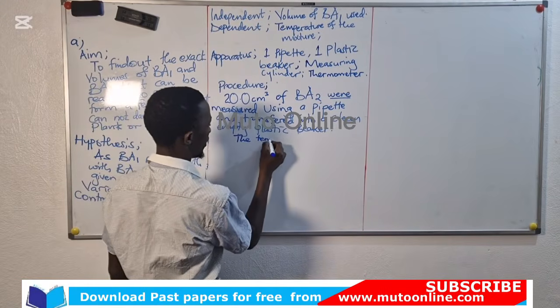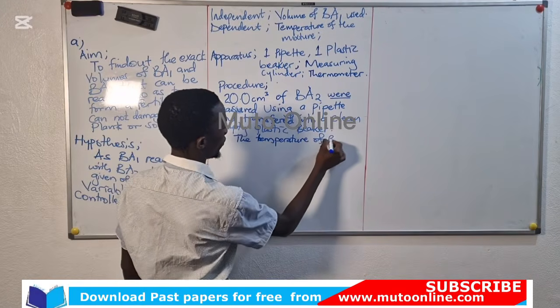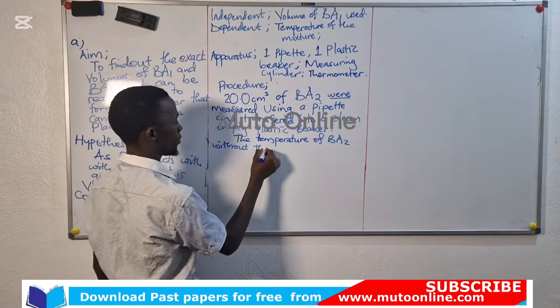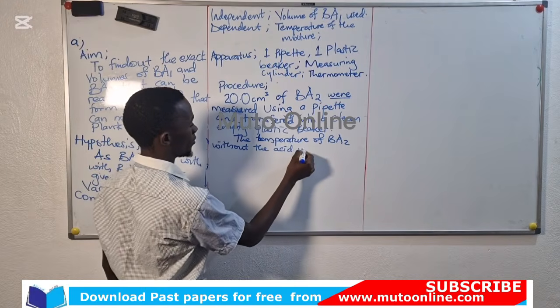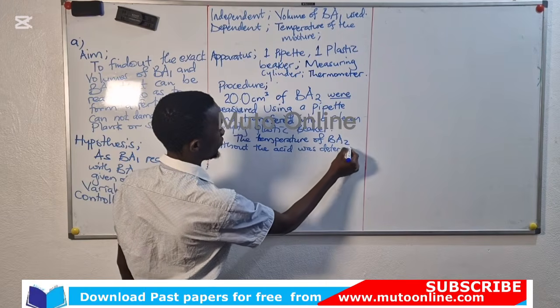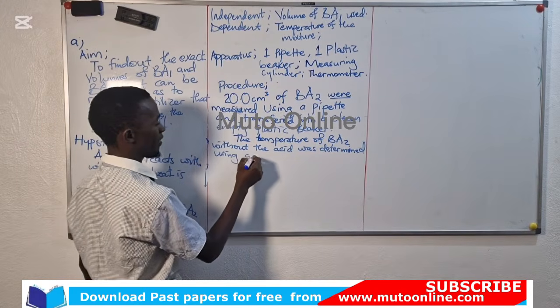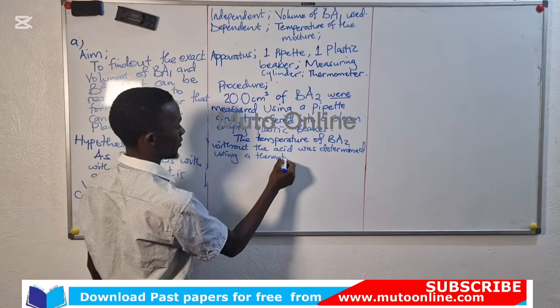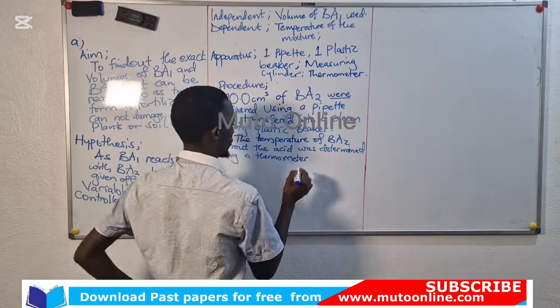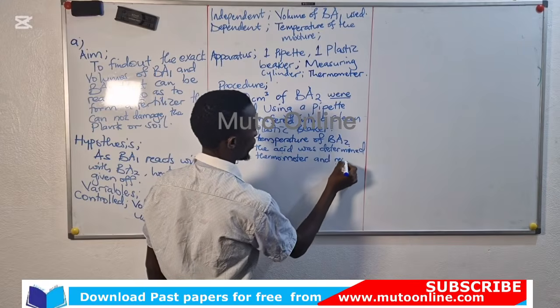The temperature of BA2 without the acid was determined using a thermometer and recorded.